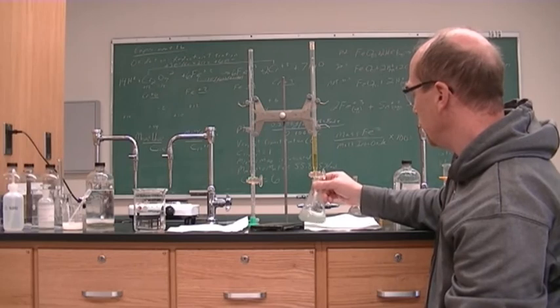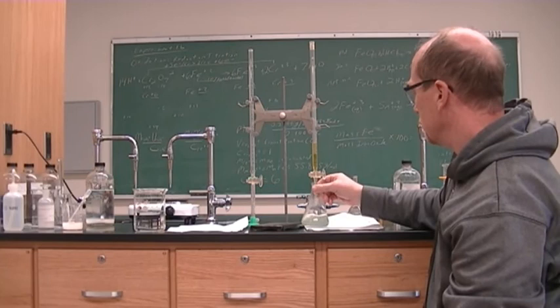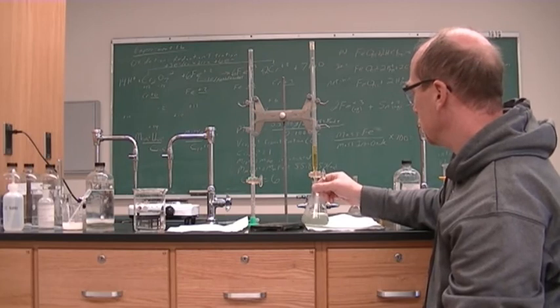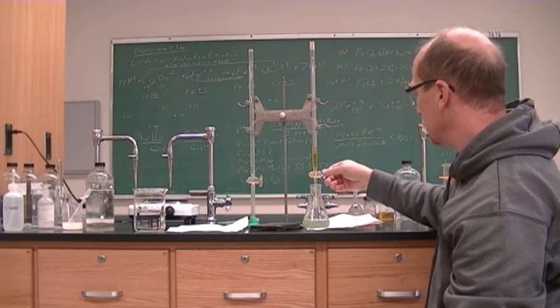The color's lasting a lot longer when it hits the green now. We're getting close to the end point. Start adding it dropwise.